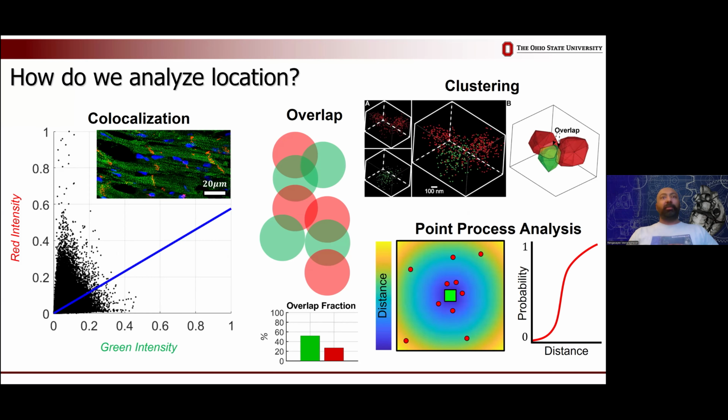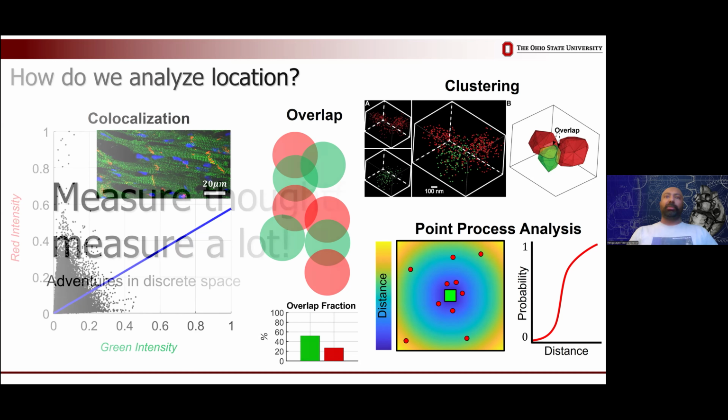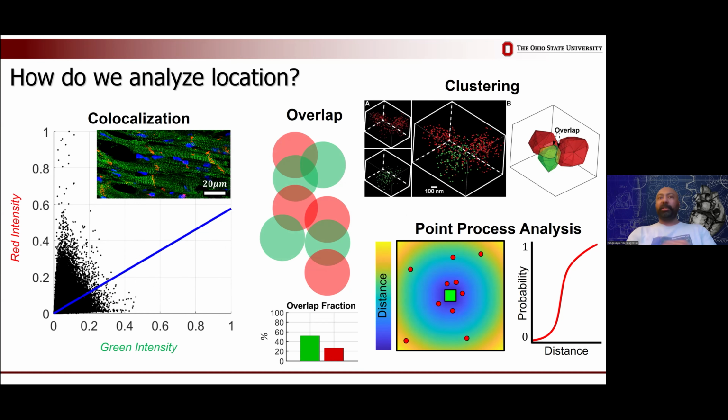So microscopes are particularly excellent at answering where-type research questions. You ask it where something is, it's fantastic at doing that. In life science, light microscopy is heavily used, and the most common paradigm that you'll see for answering where-type questions is something called colocalization or overlap analysis. These are really old traditional methods that are reliant on superposition of signals. But of course, we know that no two molecules are sitting in the same spot. So superposition of signals is really a function of poor resolution.